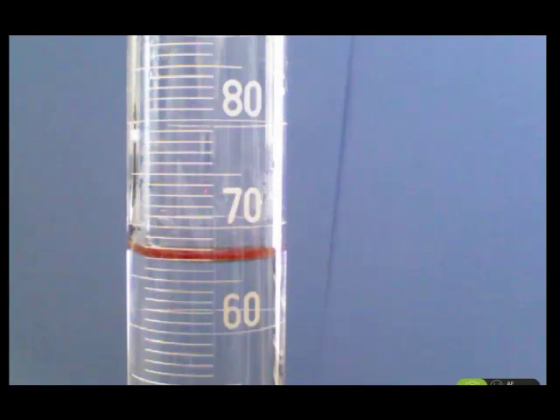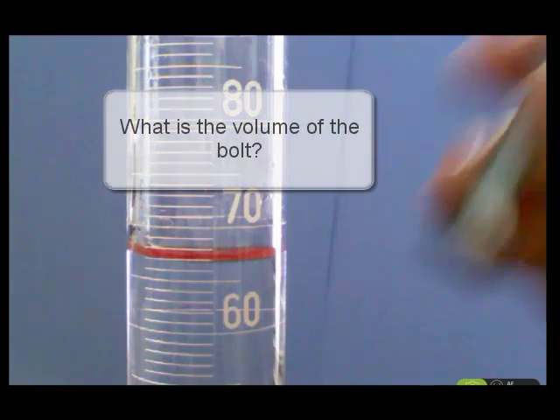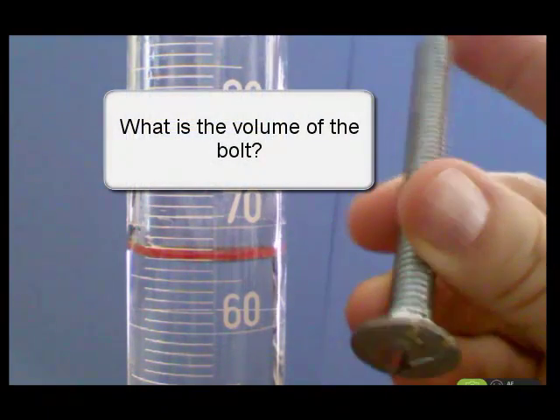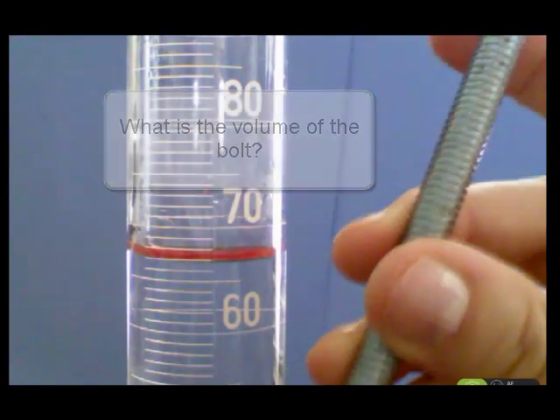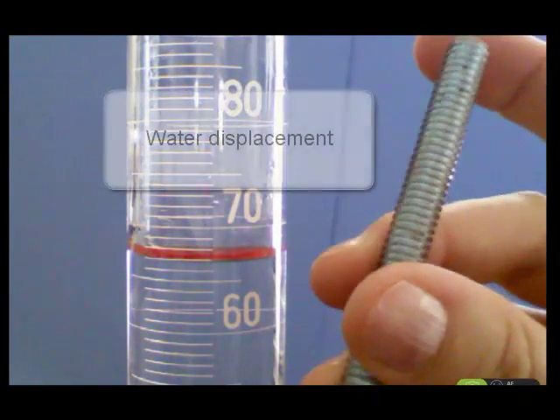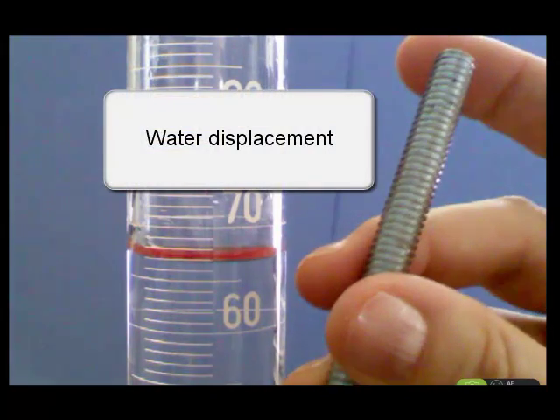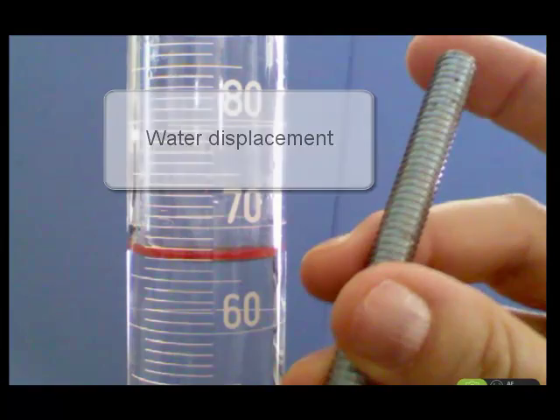Now, let's say we wanted to get the volume of some odd-shaped piece of metal, and you're going to be doing this a lot in labs. So I have a bolt here. So how would we get the volume of this bolt? Well, we could use a process called water displacement. So right now, my water is sitting at 67.0 milliliters.